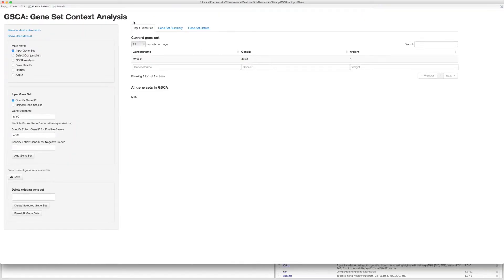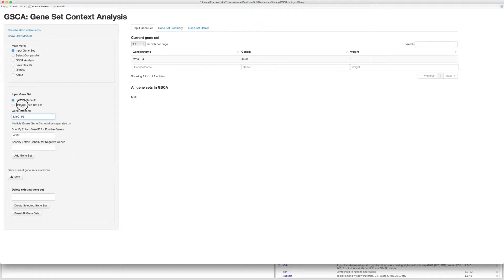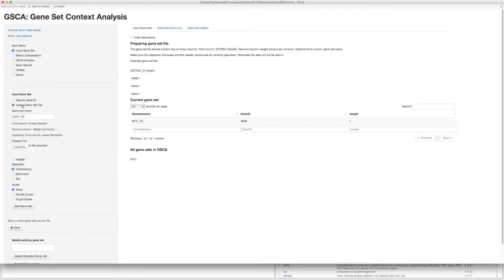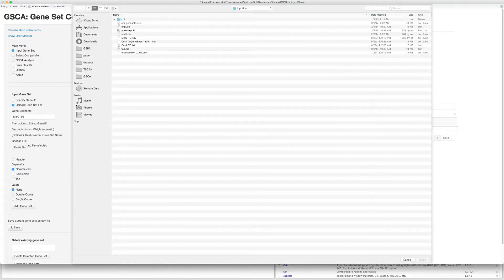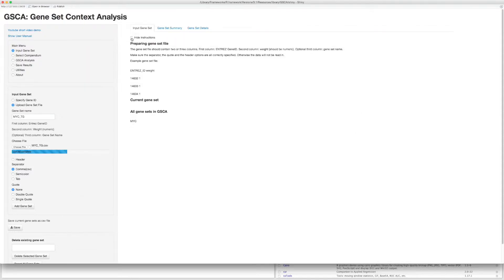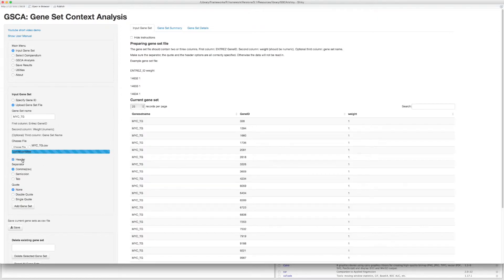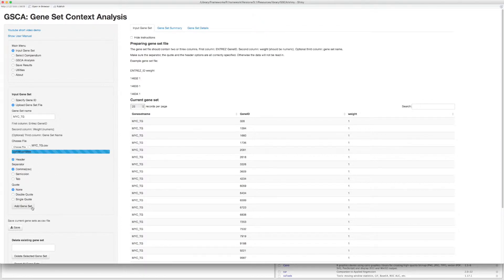Change the gene set name to be MYC target gene. Choose Upload Gene Set File. Click Choose File button and choose a file. Check header option if you have a header included in your file. Make sure the separator and quote are correctly specified. Click Add Gene Set button to add this gene set.